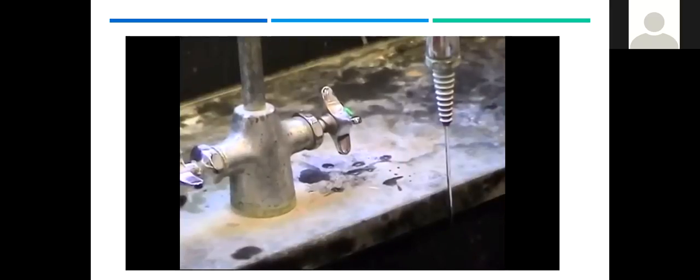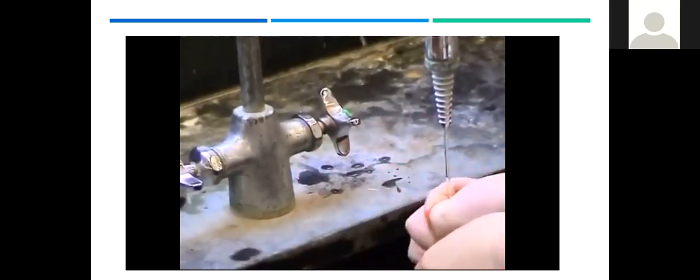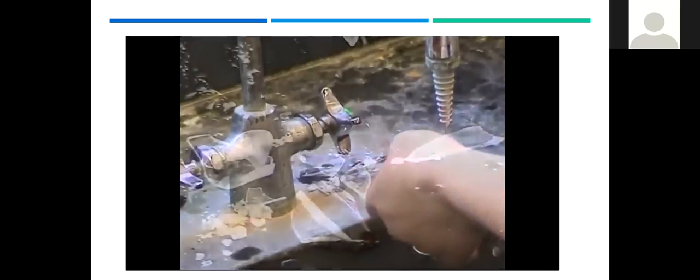Cuts in the lab usually result from handling broken glassware. This student is using the properly designated receptacle to clean up a shattered beaker, but she forgot to use a dustpan and a brush. Like a burn, flush the wound under running cold water and call for assistance so that first aid can be administered. Any blood that has dripped onto the bench top or floor should be treated with a 10% bleach solution. Wait 10 minutes to ensure complete disinfectant action, then blot up the residue with a paper towel.